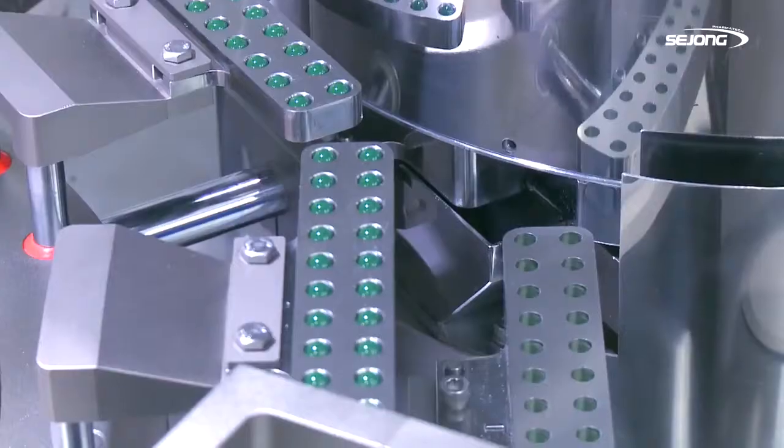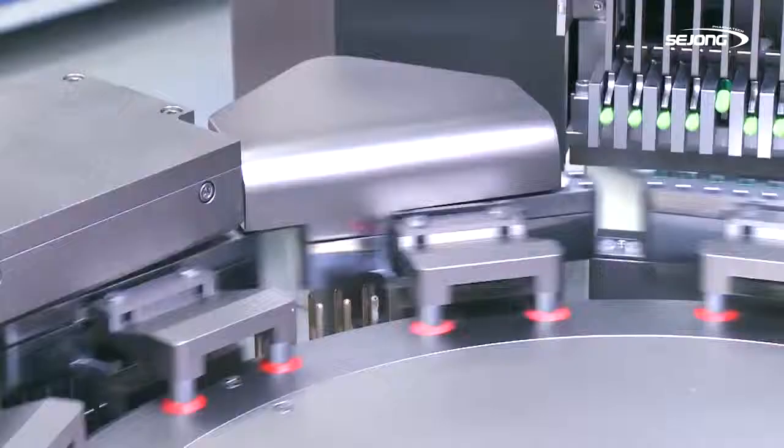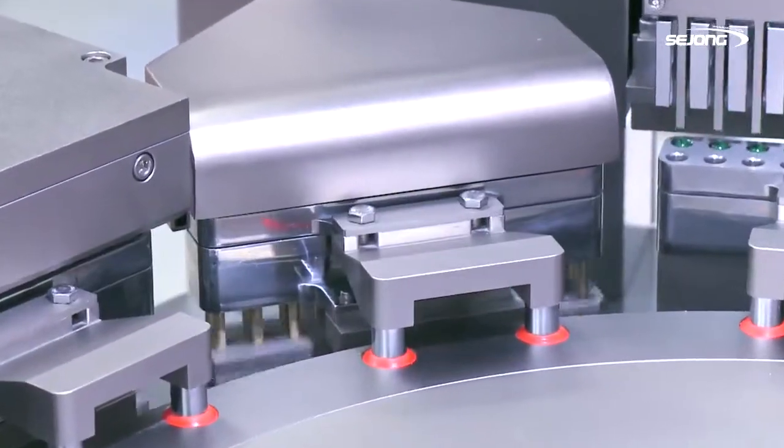We have reinforced the dust collecting function on the capsule closing, discharge and cleaning part to minimize the powder scattering in the machine.